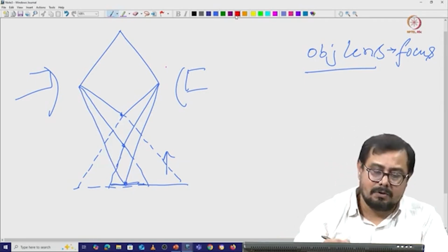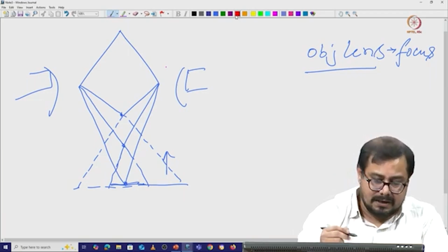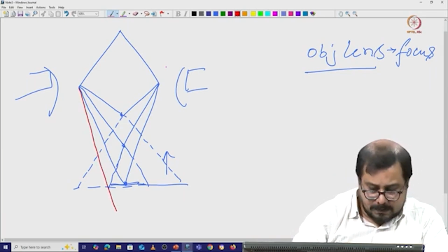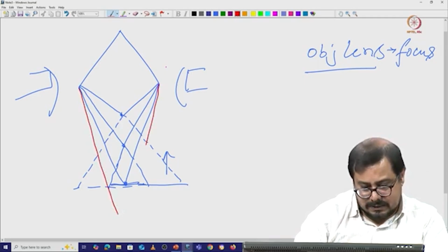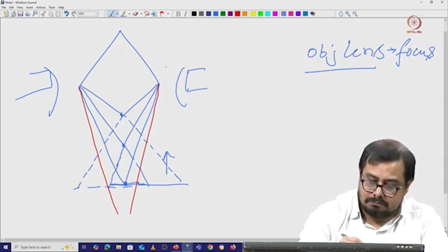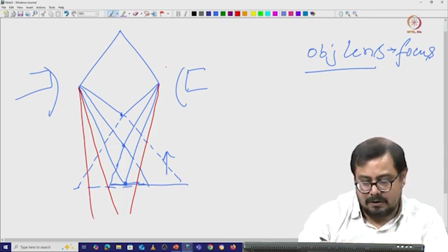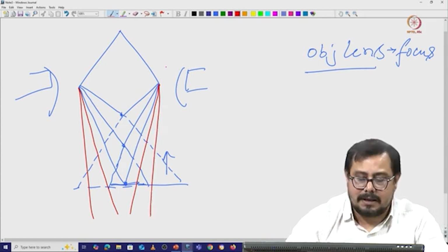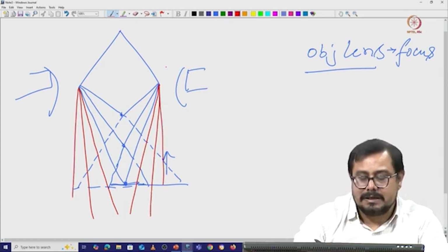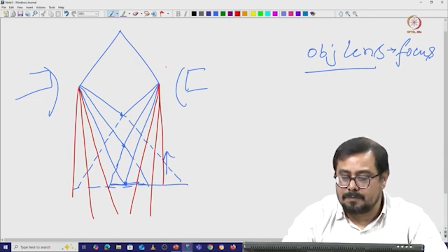Now we are talking about a very low magnetic field. If we have a very low magnetic field, what kind of image do we get? So you can see the rays are going like that. If we have almost no magnetic field, you can see the electrons can go like that. If you have an even weaker field, you can see the electrons can come almost parallel.